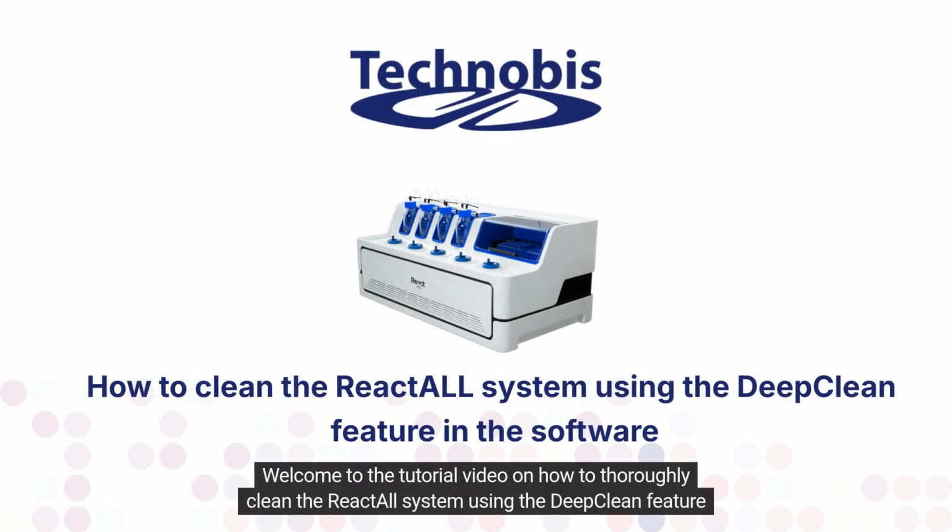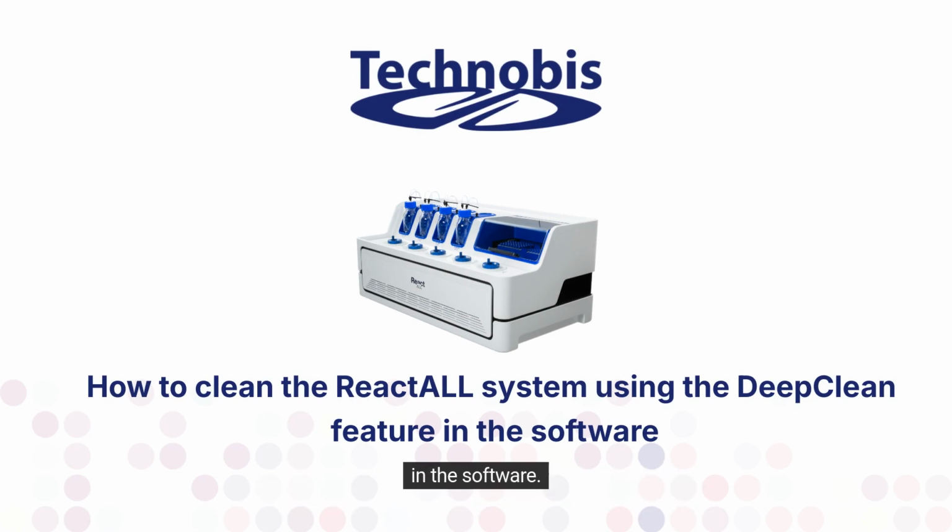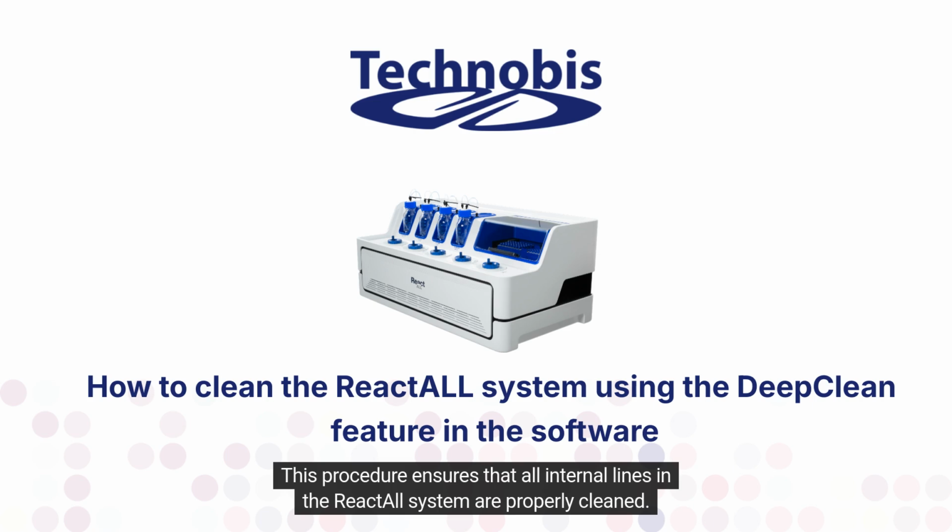Welcome to the tutorial video on how to thoroughly clean the ReactALL system using the DeepClean feature in the software. This procedure ensures that all internal lines in the ReactALL system are properly cleaned.